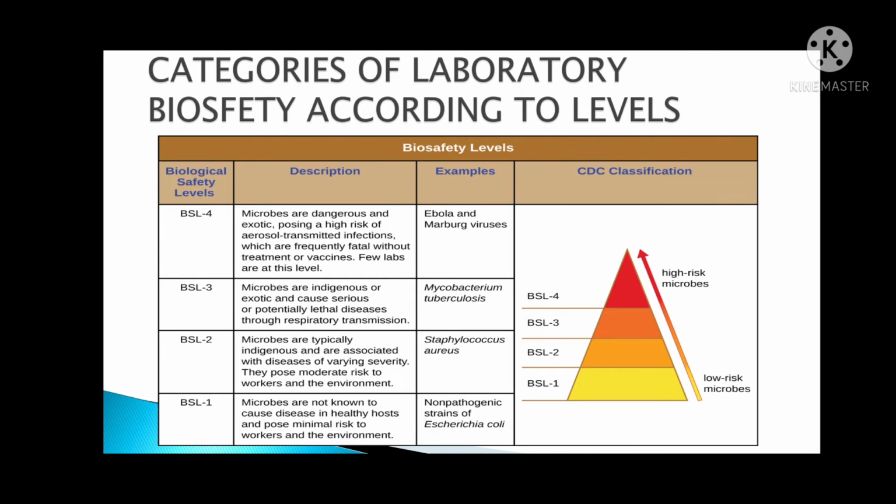Biosafety Level 3 puts emphasis on primary and secondary barriers in the protection of the personnel, the community, and the environment from infectious aerosol exposure. Work with indigenous or exotic agents with the potential for respiratory transmission and that may cause serious and potentially lethal infection is conducted here. Examples of microorganisms handled here are Mycobacterium tuberculosis, St. Louis encephalitis virus, and Coxiella.